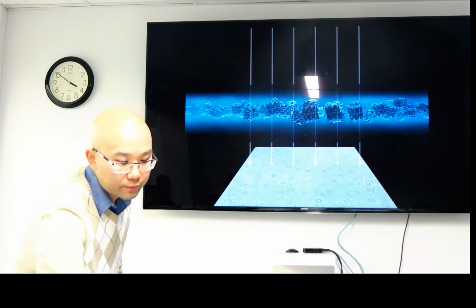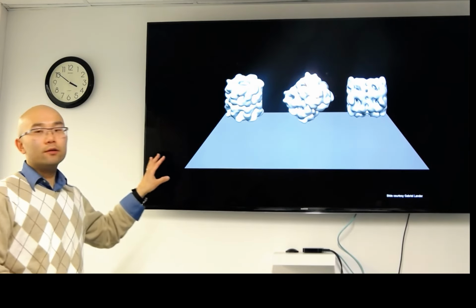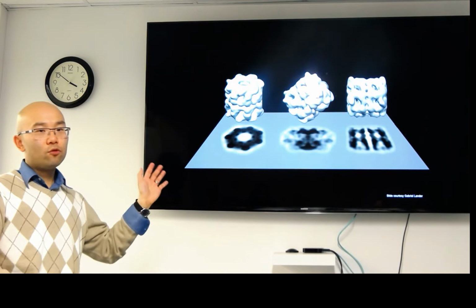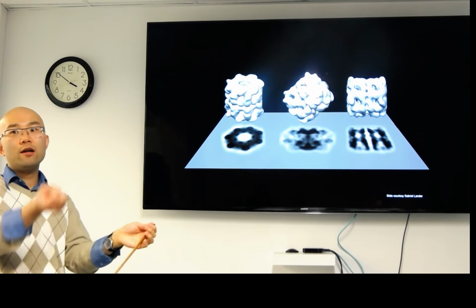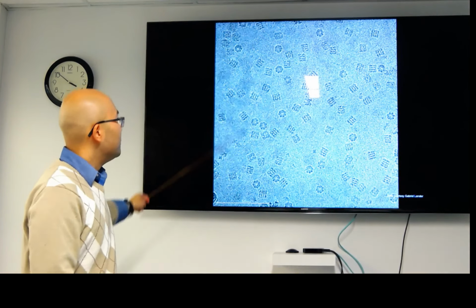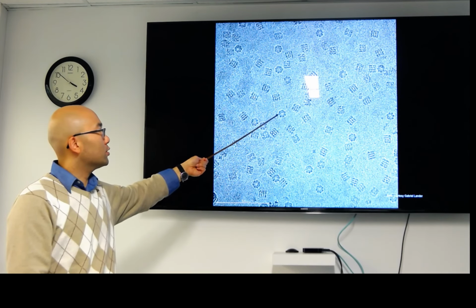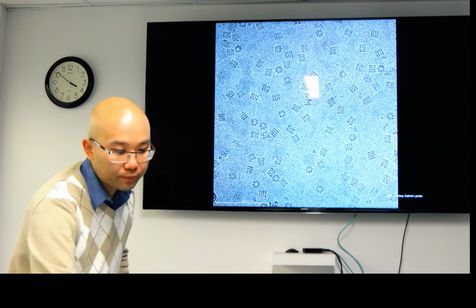Take pictures of it, and the hope would be we have many different orientations of the sample that we can take pictures of. Through tomography, we approach this by just tilting our sample through the full range. In single particle, we assume we have random orientations within our sample, and then that we can see many different views within an electron micrograph. Here's a cryo-electron micrograph where we have electron-dense protein complexes on a vitrified buffer background.